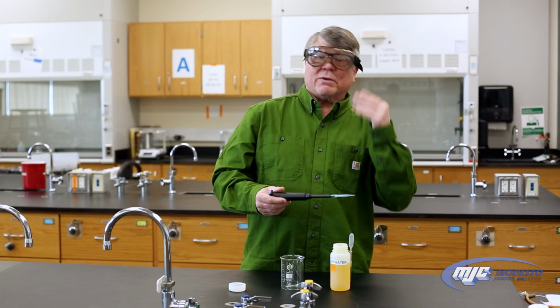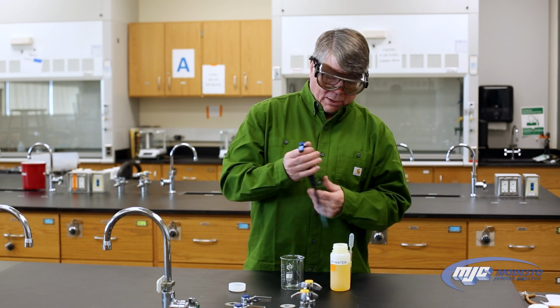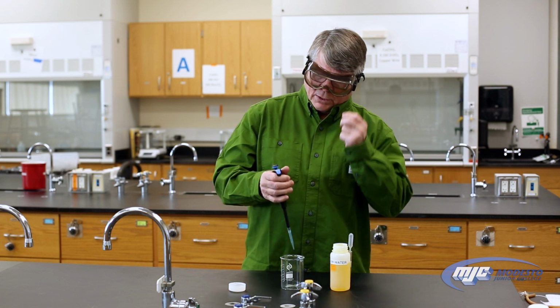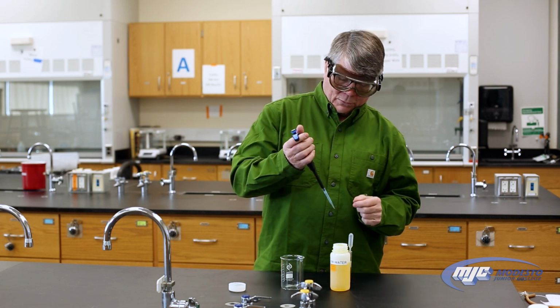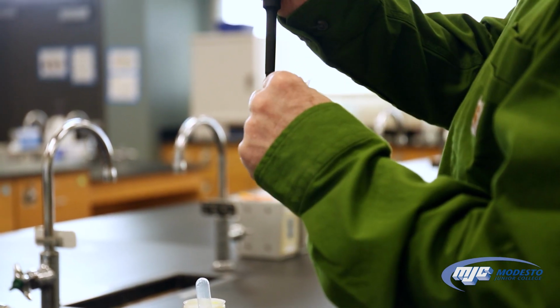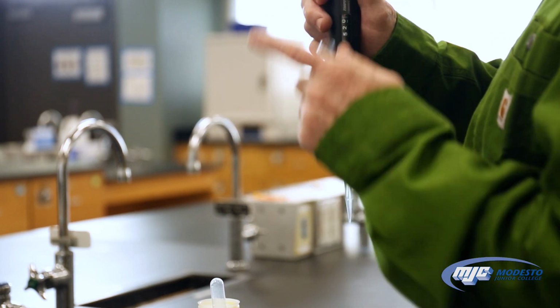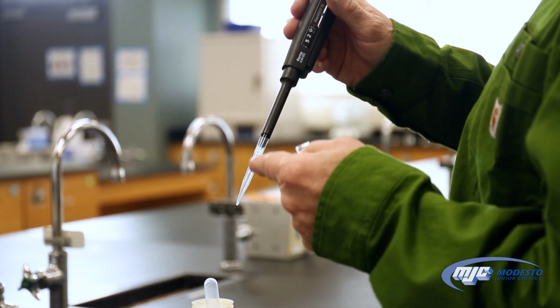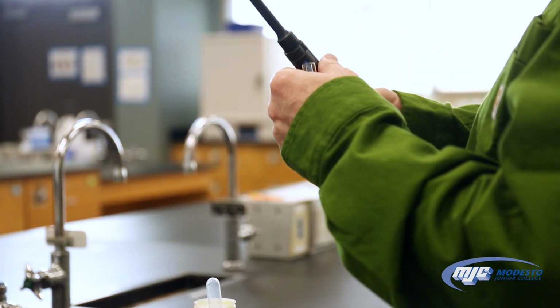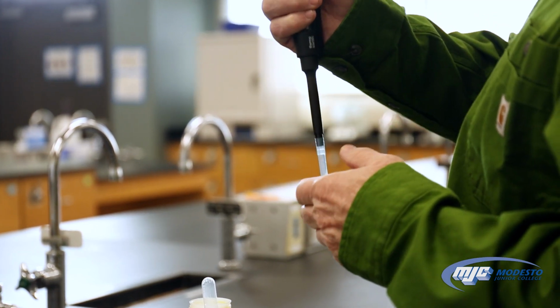So let's say I want to measure 0.519 milliliters, which is 519 microliters of this solution into this little test tube right here. So now this is crucial here. Couple of things. You should always make sure that the tip of the micropipette is pointing down, particularly when you have anything in there. You'll ruin this micropipette if you have a liquid in here and you turn it upside down. The liquid gets down in here and it can ruin the micropipette. And we definitely don't want to do that. So keep it pointing down the whole time.